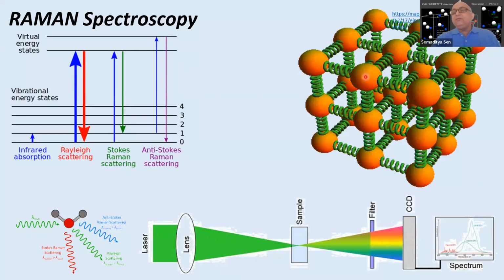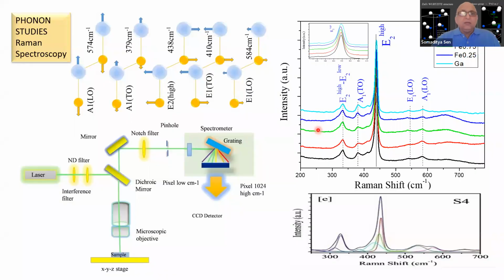There will be typical vibrations that can be decoupled, one set of vibrations that can describe the motion of these atoms.